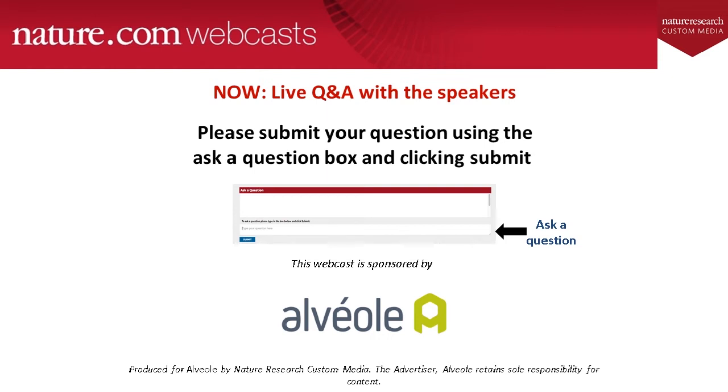Yeah. Excellent. Thanks, Leeya. Our next question asks, can the patterns be precise enough for neuronal projections? So yes, and some of us at Stanford, there's at least 2 groups who are actually working on this right now. So yeah, time will tell, I guess. But yes, we are trying. I mean, I haven't tried anything submicron, but micron scale micropatterns should be able to give us some interesting insight, or at least some helpful positioning for neuronal cell culture.